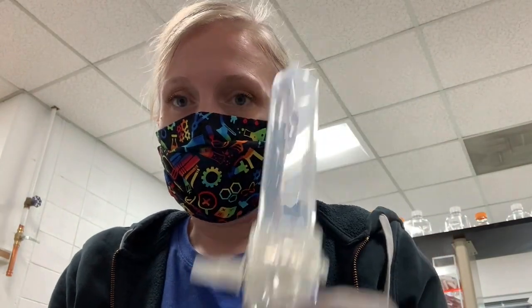So this solution is almost filtered. So I'm going to turn off the vacuum. Remove the tubing. Now you can see the liquid is in the bottom.